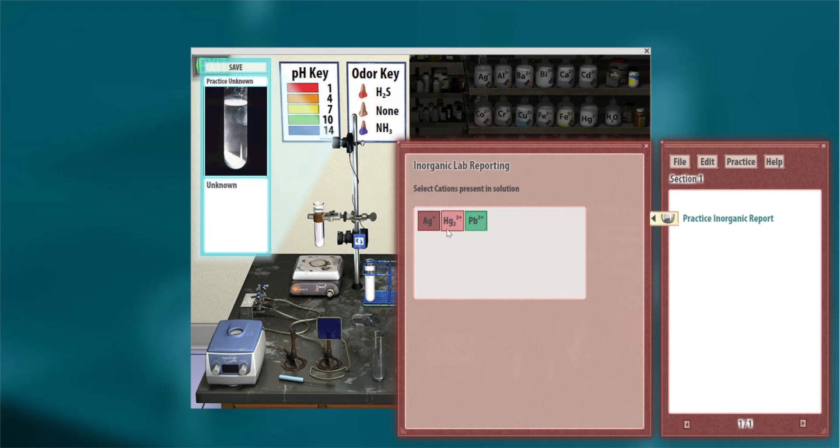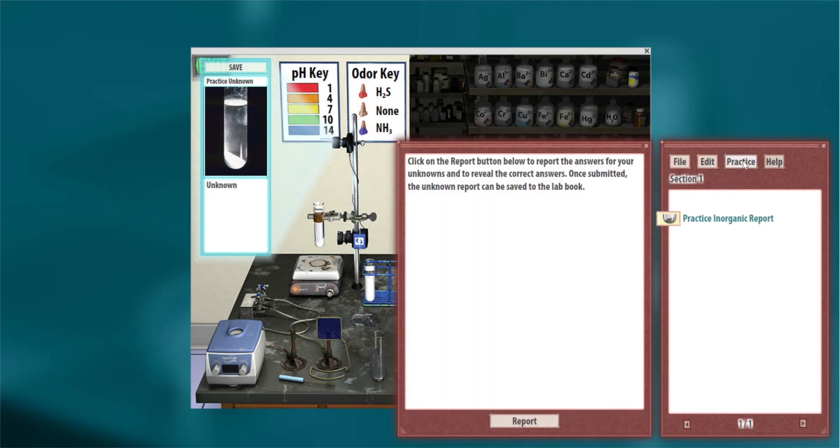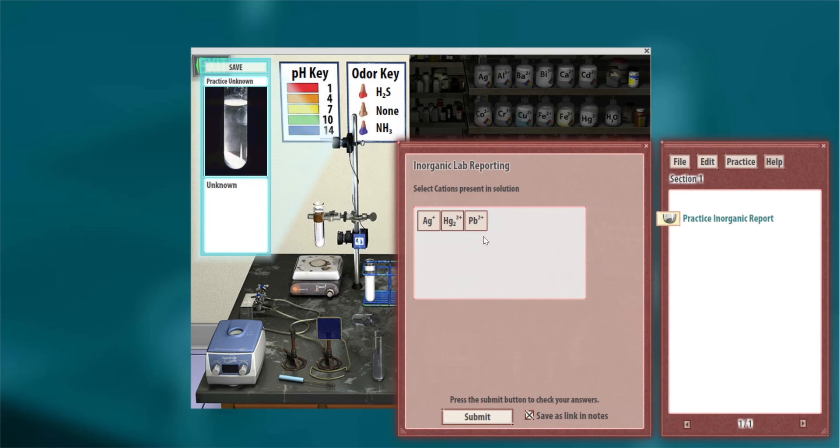They re-enter and report again with their revised answer. This time they get all green boxes, meaning they guessed correctly. They've learned how to distinguish, separate, and perform basic qualitative analysis experiments. We hope this is useful.